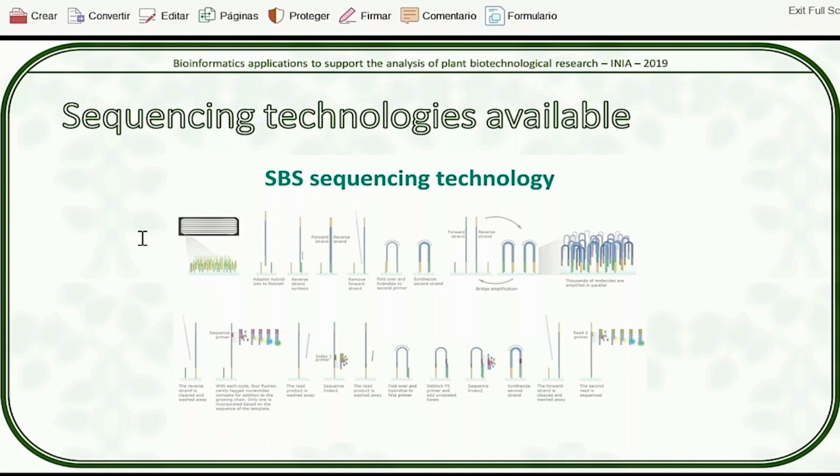All these things are taken into account by the machine, and they have specific algorithms to do that base calling. This is the process called base calling, trying to convert these videos into actual FASTQ data, the one that you just saw. Luckily for us, Illumina has done an amazing job in improving their base calling algorithms, and more often than not, you get high quality sequence from Illumina machines. The most frequent reason for low quality libraries or for low quality sequences in Illumina machines is poor management of the machine or a bad library in the lab. That's usually the case.